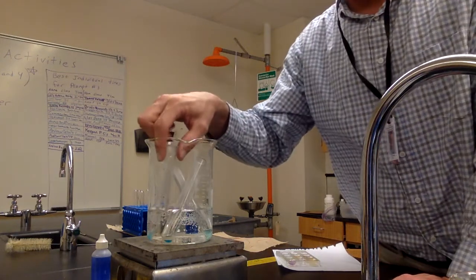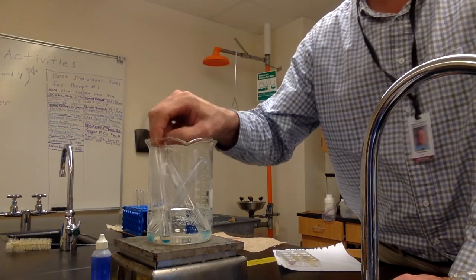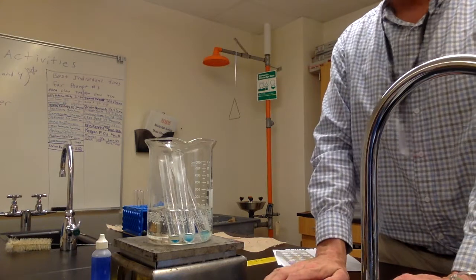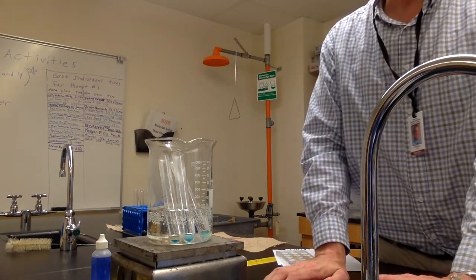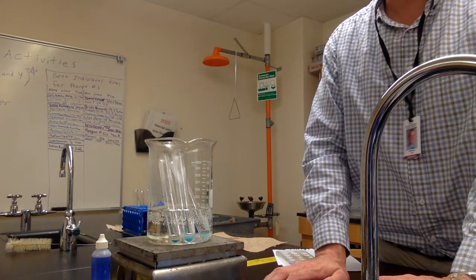Okay. Now you wait 5 to 10 minutes for the colors to change. Okay, and oh, magical time machine, we've waited now 10 minutes. I had a great conversation.